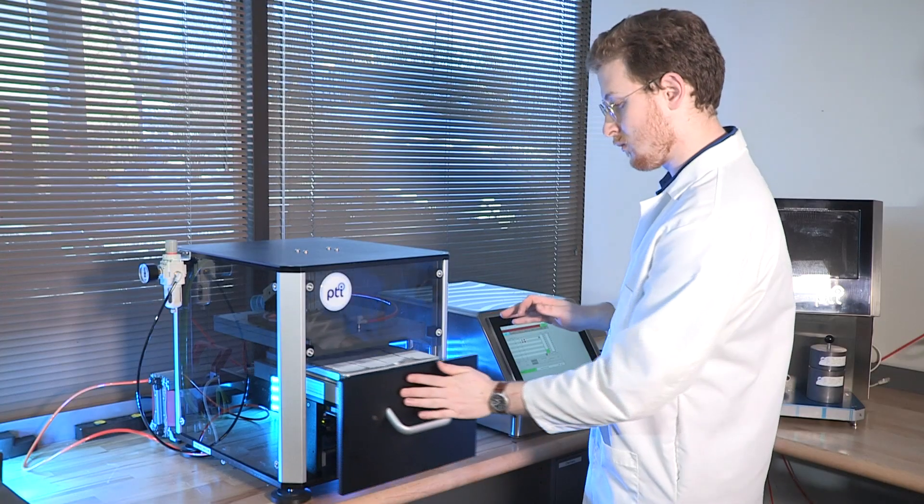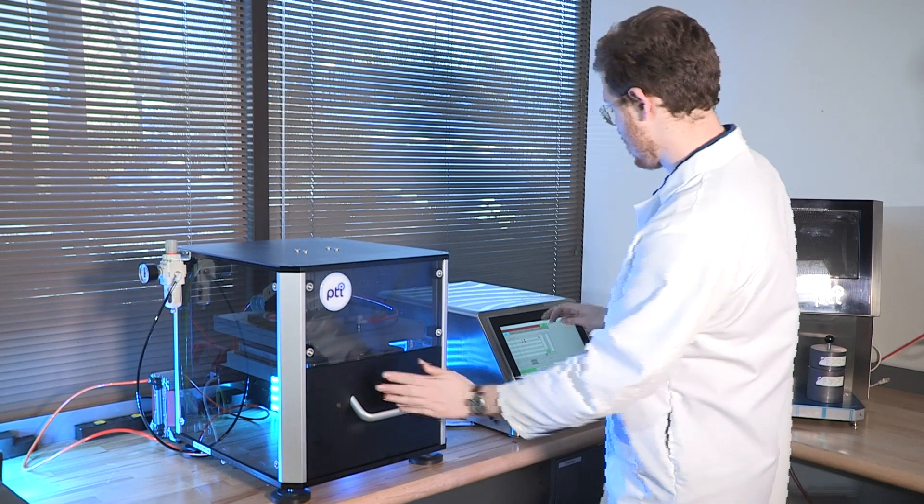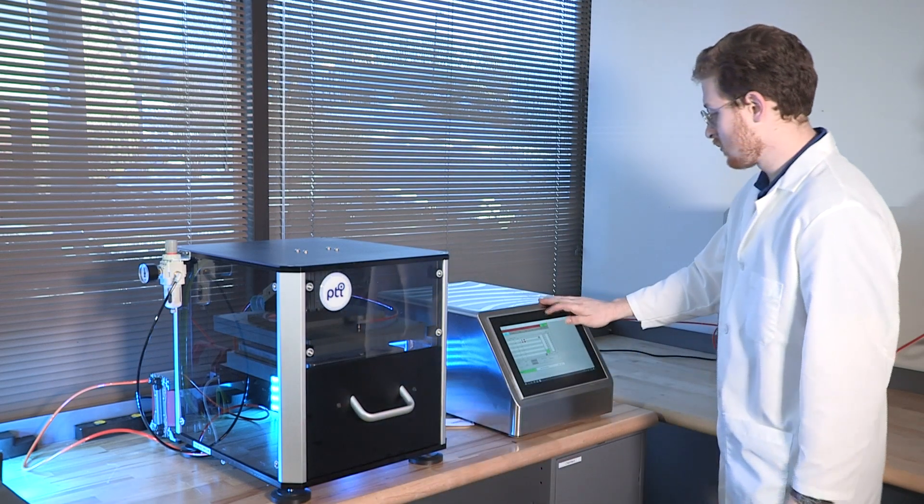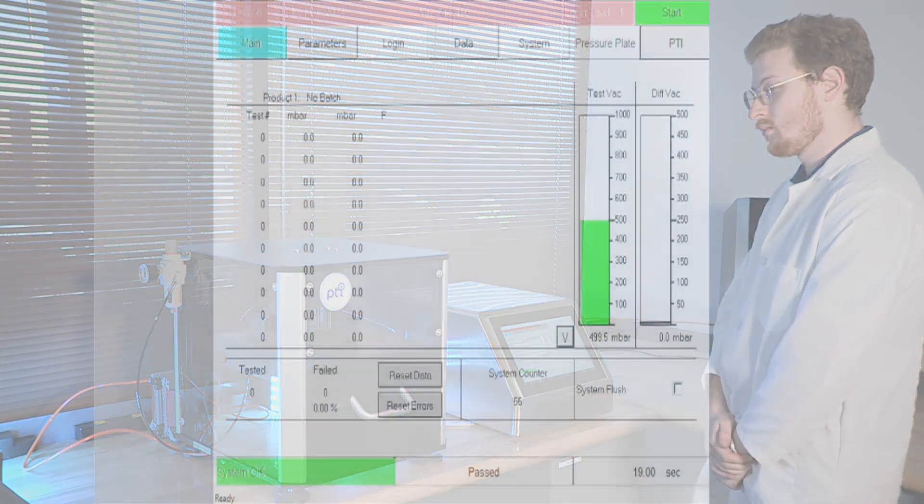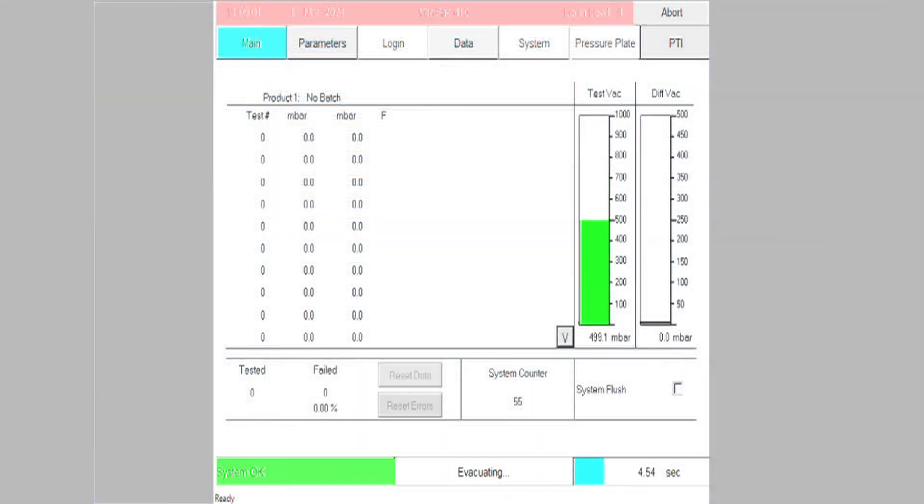The Verapak series of machines utilizes the ASTM F2338 vacuum decay standard.